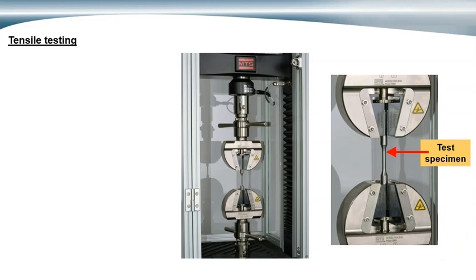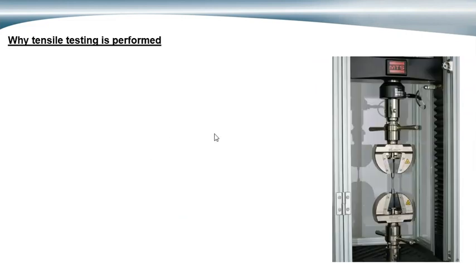Here is a tensile tester. Tensile testing is used to measure the tensile properties of metals and other materials, also plastics. This shows a sample being held between the two grips of a tensile tester, and here's a close-up of the sample in the two grips.